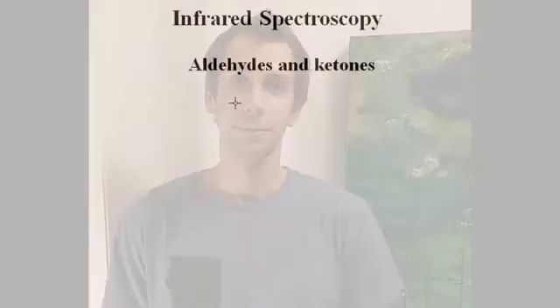Hi, I'm John, a chemistry graduate student at UCLA. In this video we're going over some chemistry topics. Hope you find this useful and good luck in your course. Aldehydes and ketones show characteristic strong infrared absorption in the region between 1630 and 1820 wavenumbers. This is associated with the stretching vibration of the carbon-oxygen double bond.